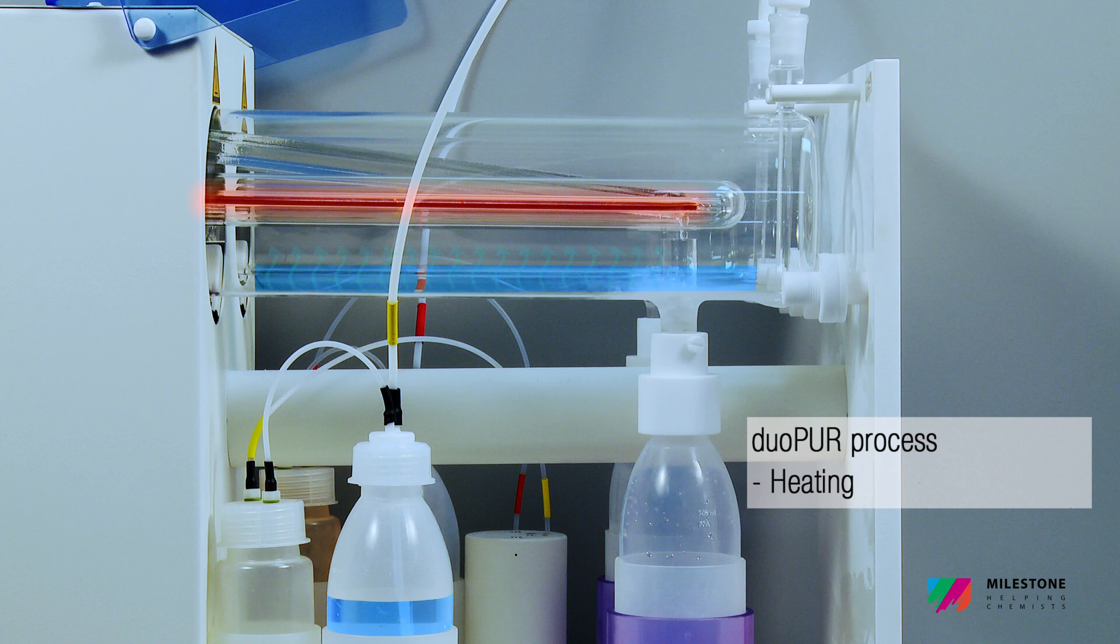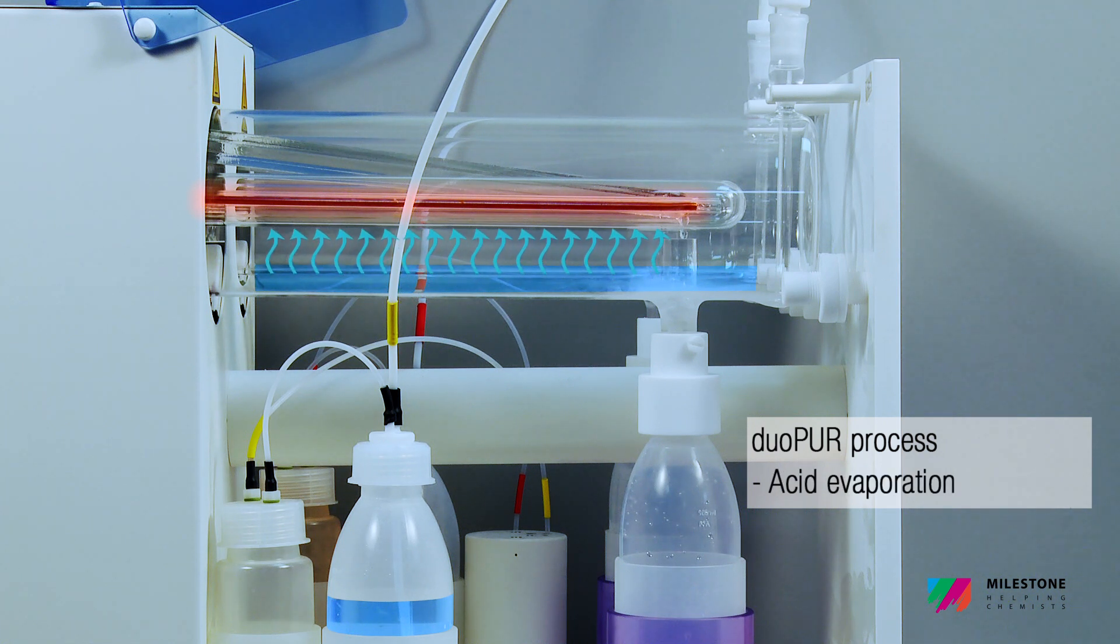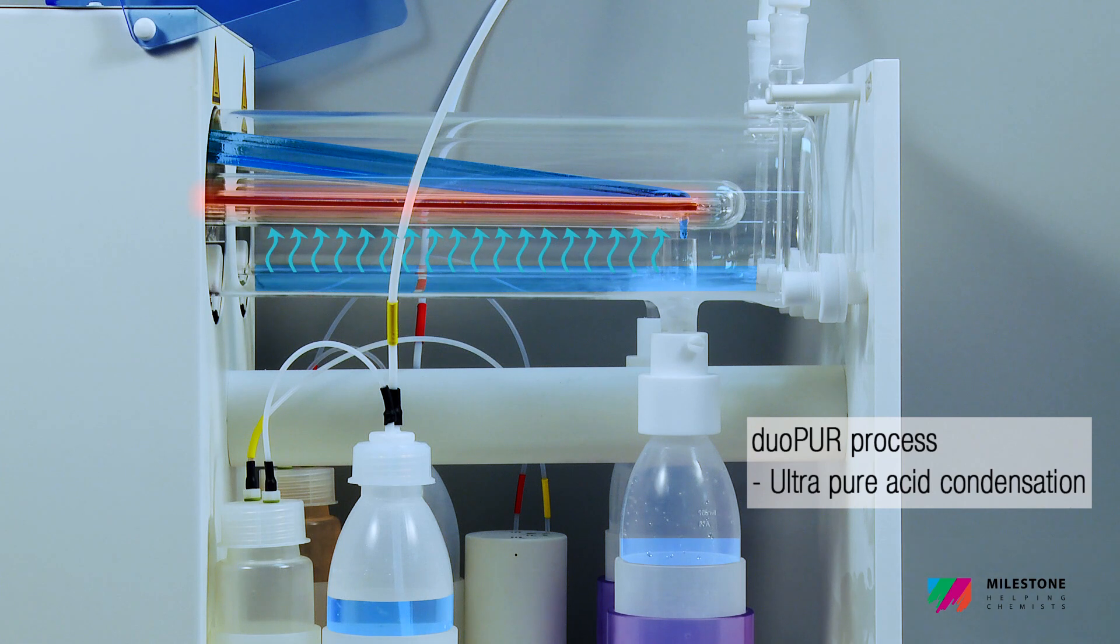While standard operations with purchased acids may introduce contaminants during daily activities, the DuoPure allows on-demand acid purification, ensuring a continuous supply of fresh, high purity acids.